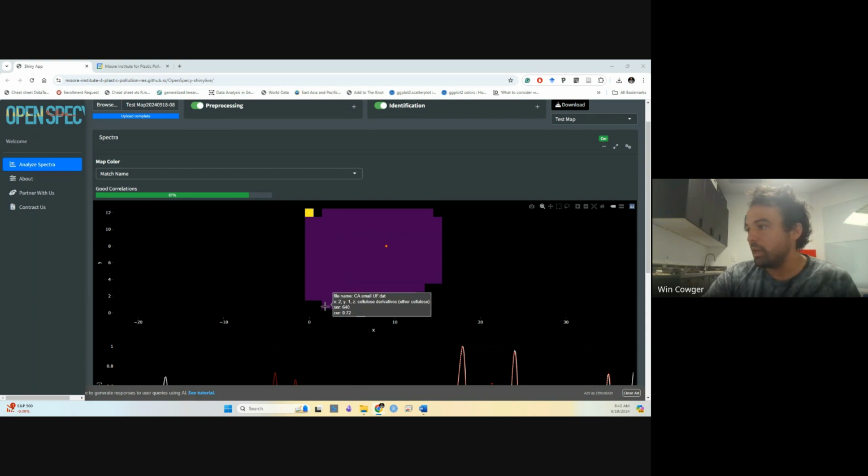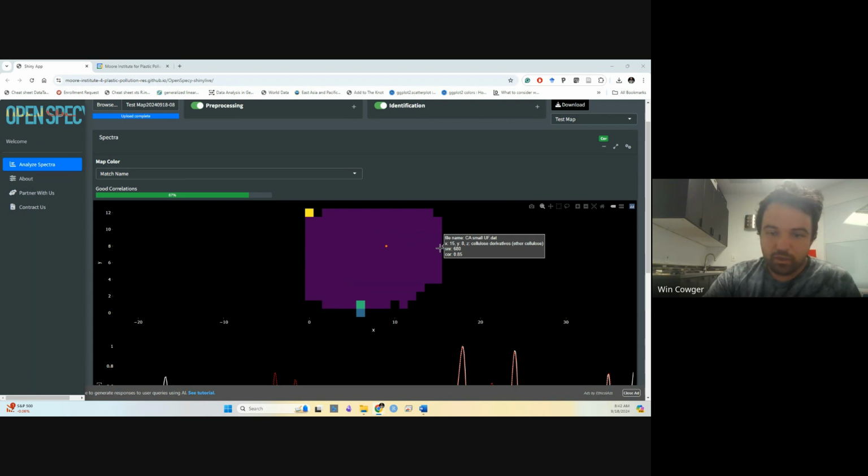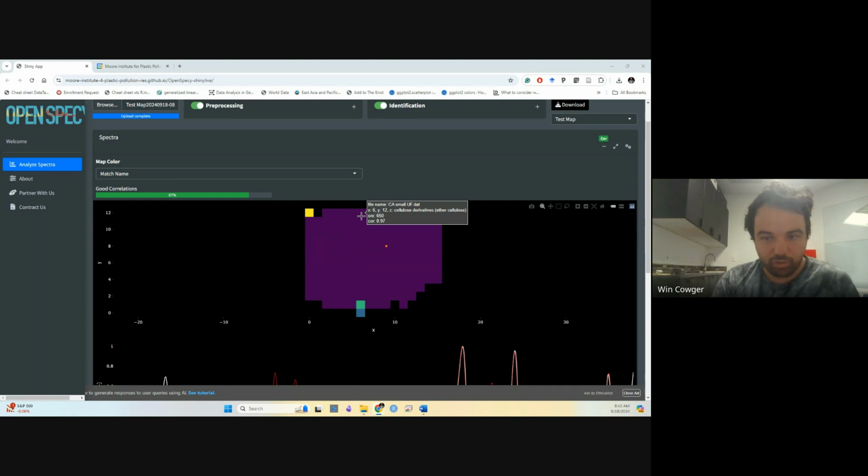We can take a look at this. The y-axis goes from 1 up to 12. The x-axis goes from 0 over to 15. So you have 16 pixels on the x-axis, and what is that, 11 pixels on the y-axis. Multiply each of those by 25, and now you have your particle dimensions.